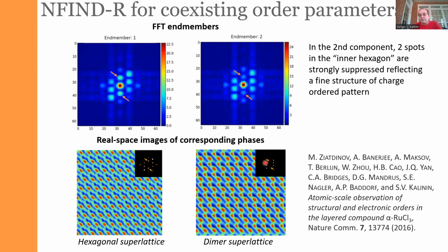So inversion of the Fourier transform is obviously a complex problem because of the phase problem. So if it were not the case, there would be no science about the X-ray scattering. But we still can invert the Fourier transform and essentially get a Patterson map, which sort of allows us to visualize these two structures.